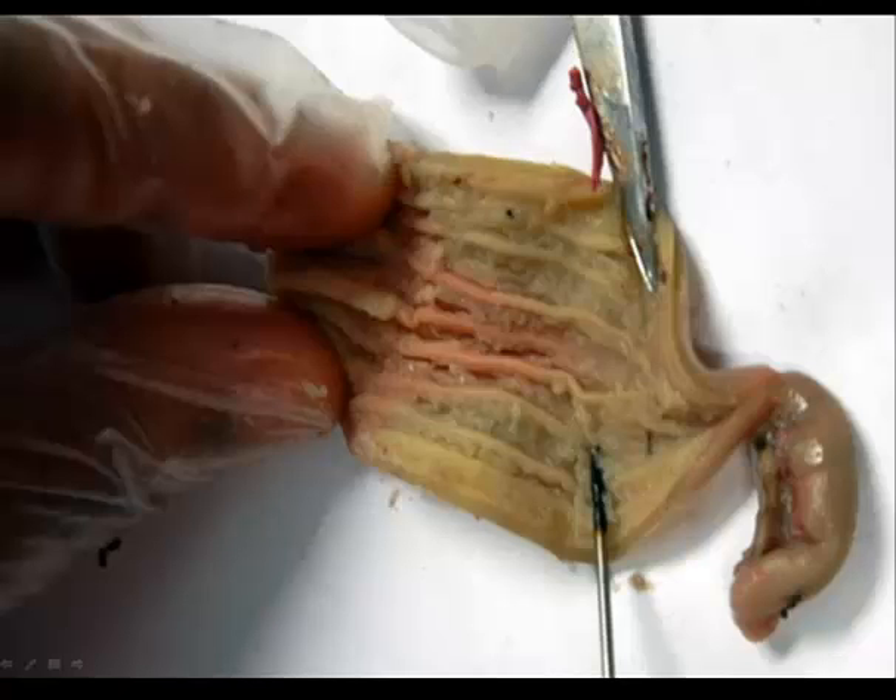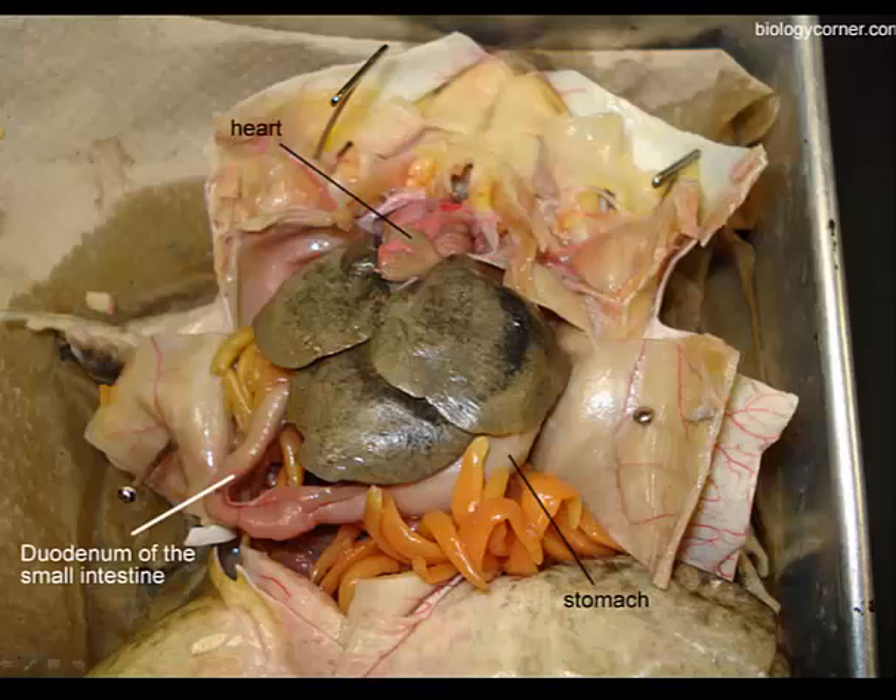When we open up the stomach, here are the folds we see — these are the rugae of the stomach. We can trace from the stomach into the first portion of the small intestine, which is the duodenum. From the duodenum, it leads to the folded-over region of the small intestine, which is called the ileum.